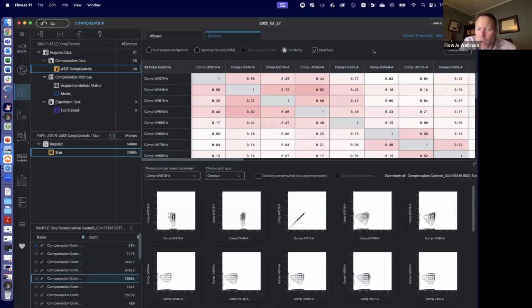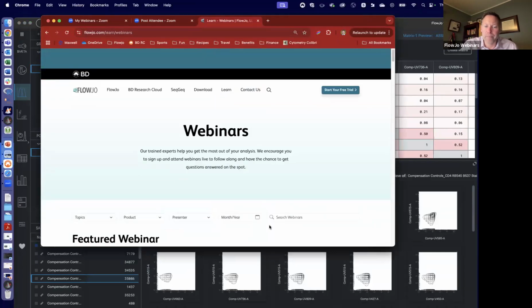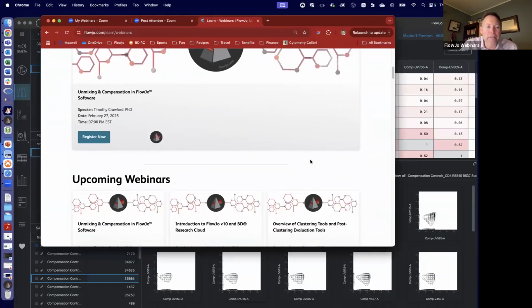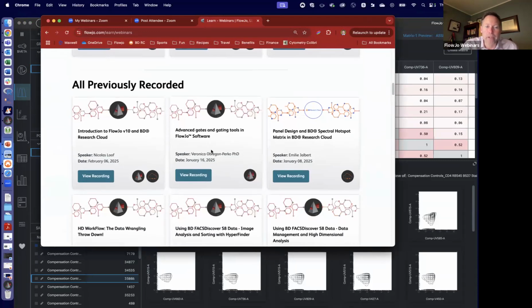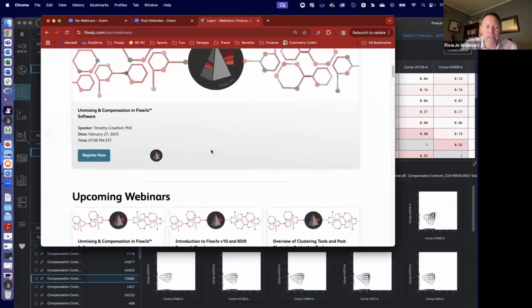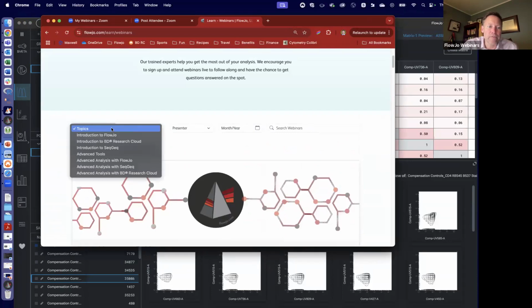There's a couple questions of, will this recording be made available and can I get the recording? The answer is yes. Every one of our webinars gets recorded, and you go on the Learn tab here. This is our new updated website. So upcoming webinars are here. Here's the one we're doing right now. And then all previously recorded, this one will pop up in a couple of days. And so you've got all the previous ones we've done, as well as the way to search and filter for particular things that you're looking for.